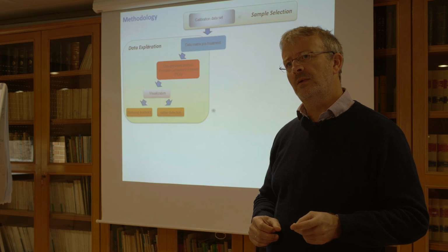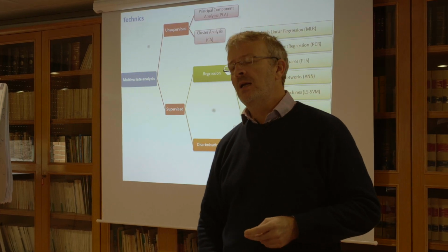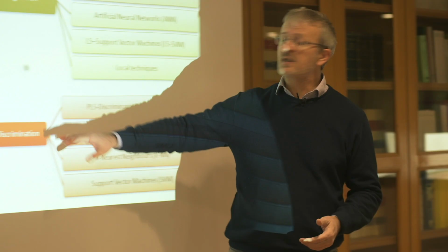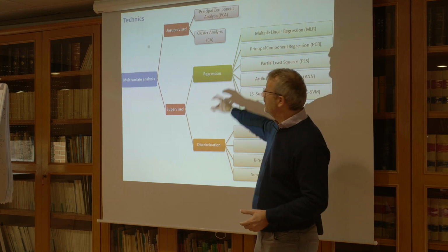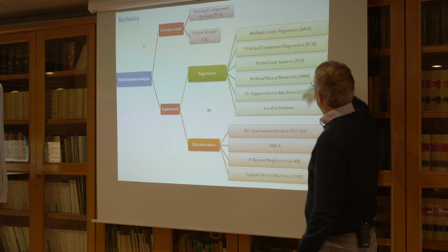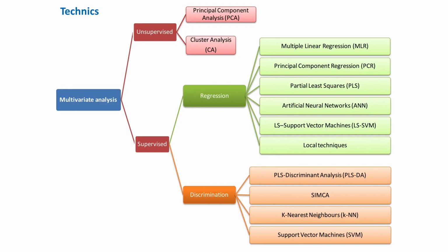And the third question was: among the models, which one is frequently used in the models you have listed? Oh yes, I have no answer to your question. You need to test a lot of models. There is no simple answer. When you want to create a model, for example, to discriminate, you only use this type of technique. But when you want to quantify something, you use this type of technique. But which one is the better? There is no answer. It depends really on what you want to predict. That's our job, to find the way to have the best prediction.